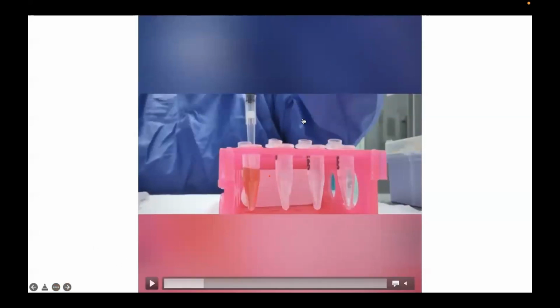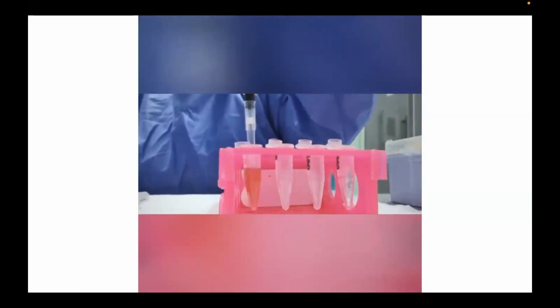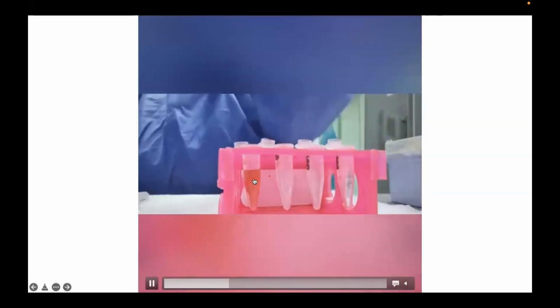May tendency po na hindi accurate yung makuha nating volume kapag ka naka-slightly bent pag mag-a-aspirate pa lang. Okay, so nag-a-aspirate lang ng 2 to 3 times. Tapos kapag ka i-dispense, dapat against the wall, 10 to 45 degrees angle. Ayan. Tapos hindi din po fully submerged hanggang dulo, dapat just below the surface lang. Hindi din po sobrang babaw, nandito yung filter tip, hindi po ganun. Bawal yung nandito din sobrang lalim, just below the surface.